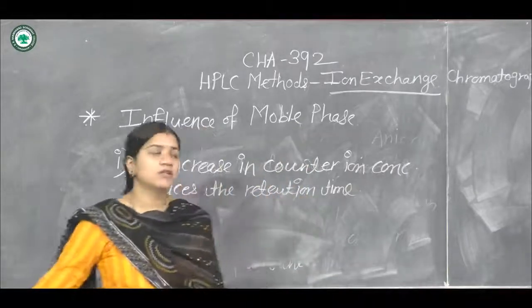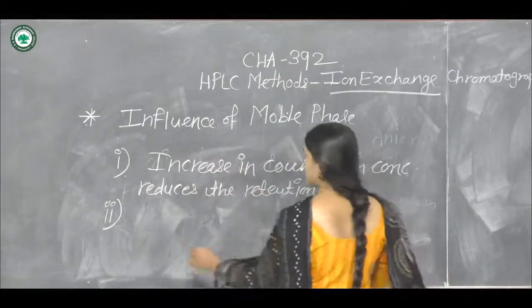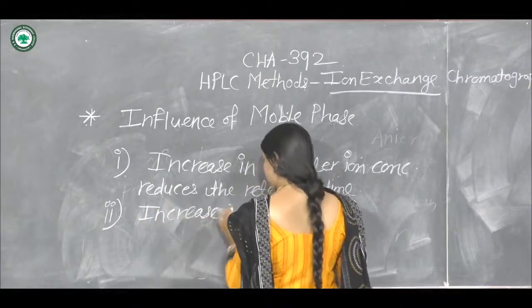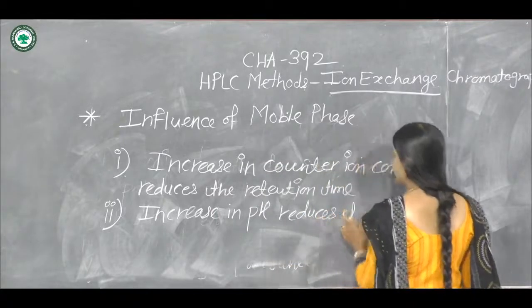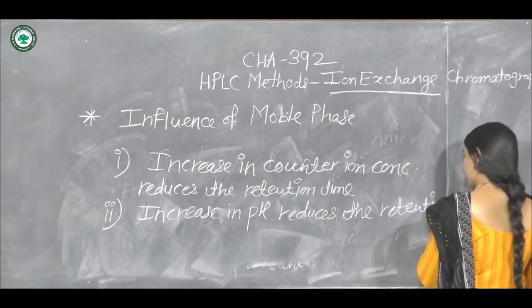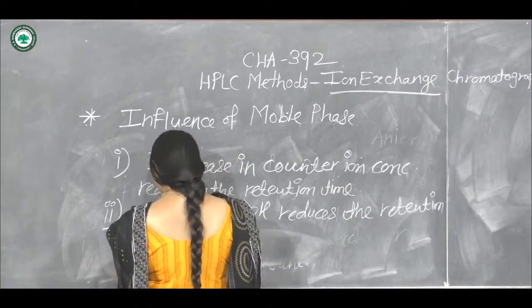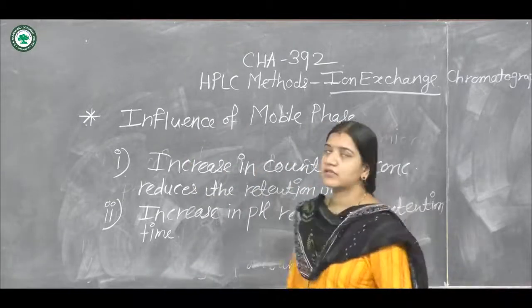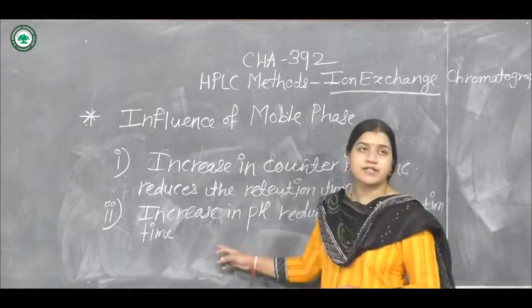Then the second one: an increase in the pH of a solution also reduces the retention time.